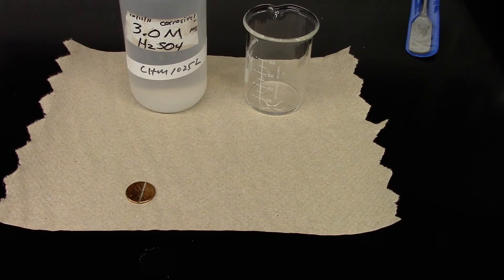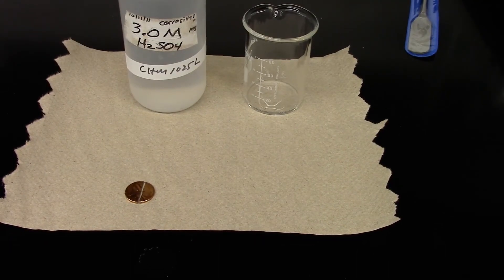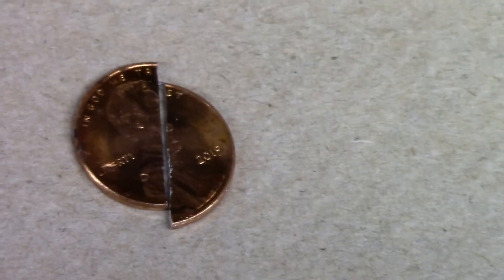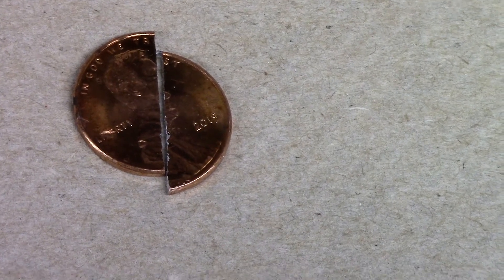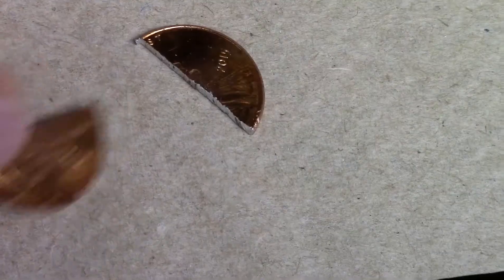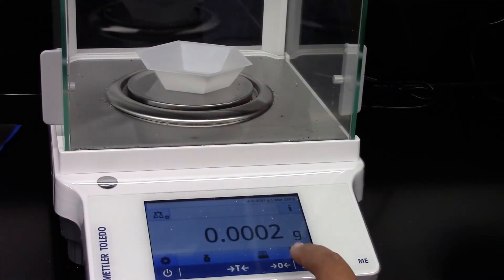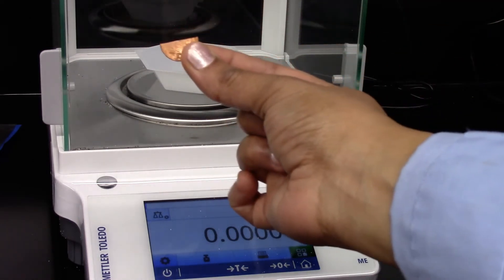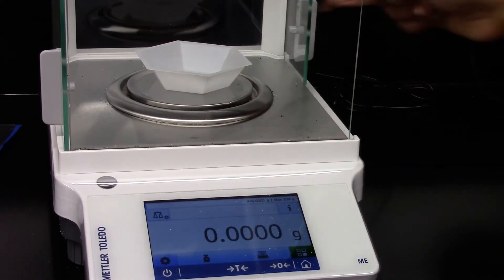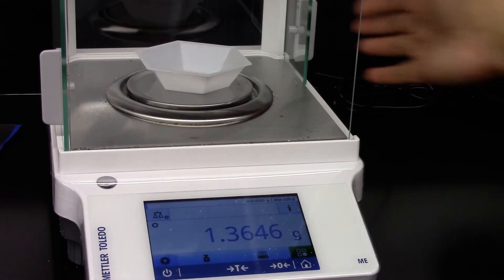So I have a penny cut into two pieces. We're going to look at the mint date. So the mint date is 2015. I'm going to use one of these pieces. I'll tare the balance. And then put my piece of penny in the weighing pan.